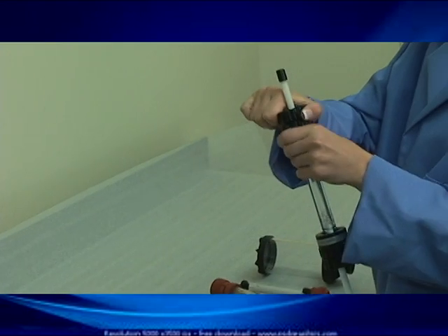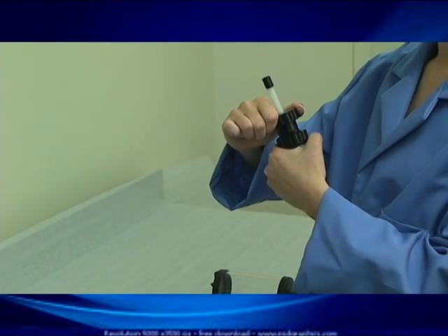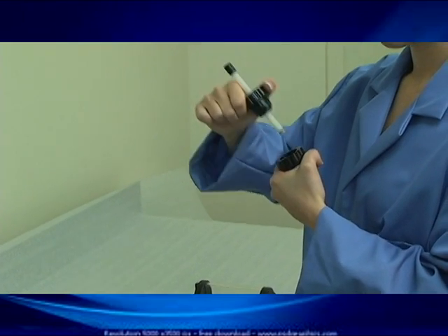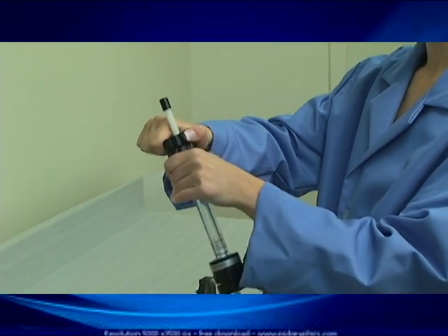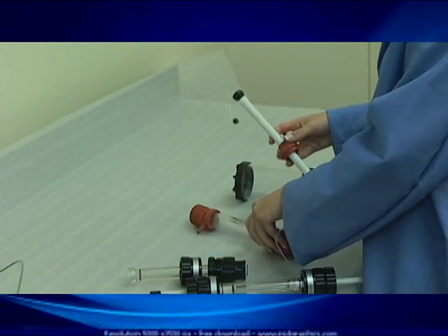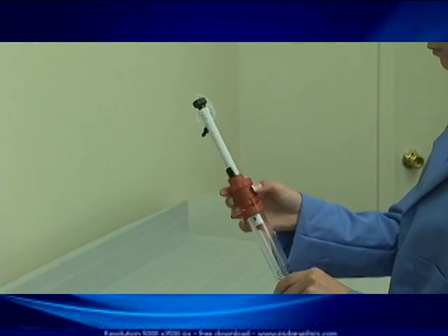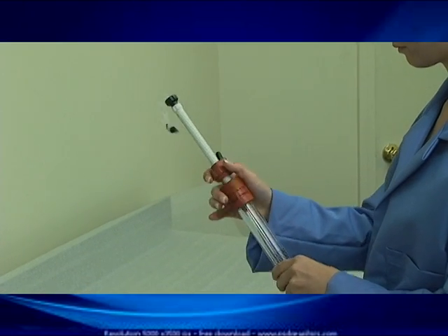Our quick-connect design works much like a child-proof medicine bottle — one quarter turn easily disassembles the column. Once the quarter turn is made, the column quickly comes apart. Turn it back and it snaps together and locks in place. The comparative column, on the other hand, uses a threaded end, which requires a little more effort to assemble and disassemble.